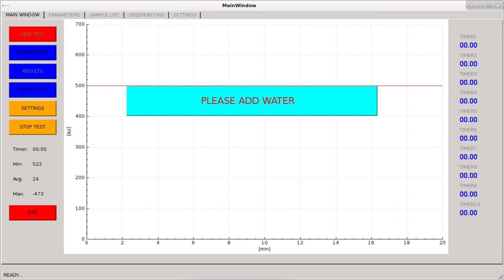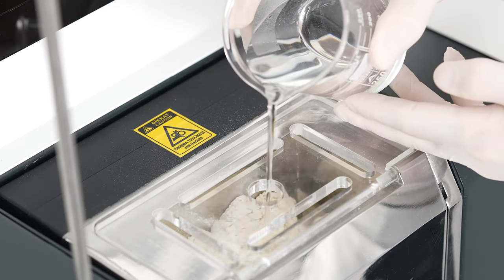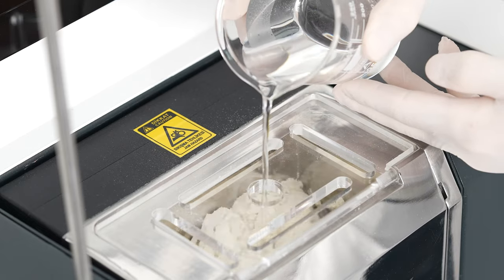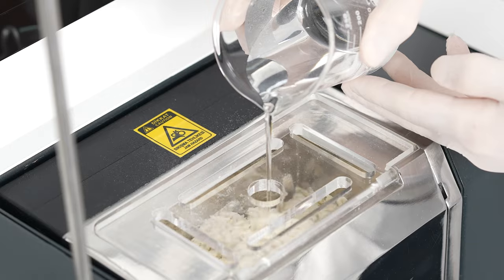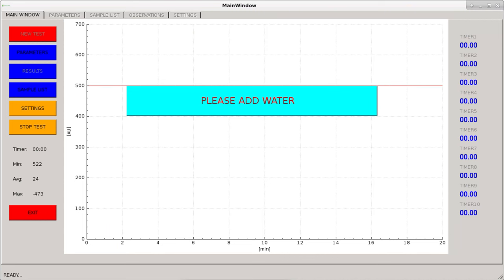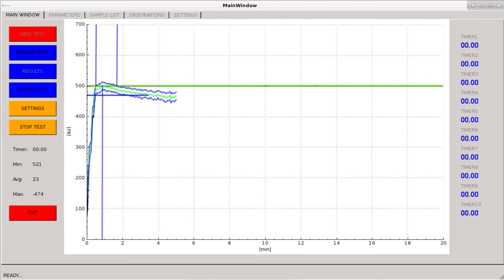At the end of the mixing time, the warning 'please add water' appears. The brine mixture is transferred with a beaker onto the flour sample through the gap in the plexiglass cover of the kneading unit.